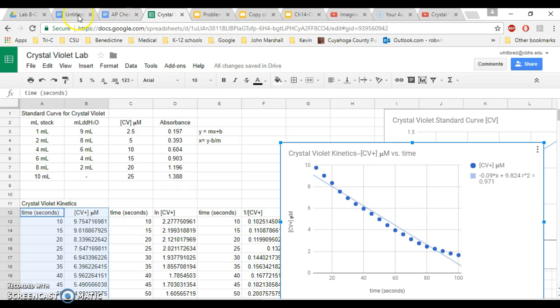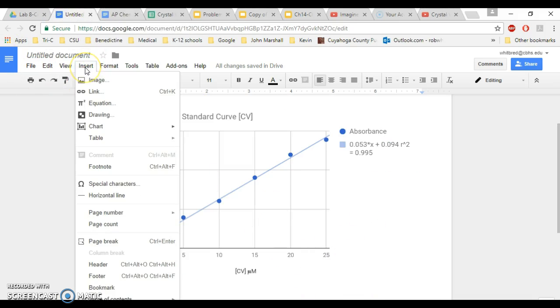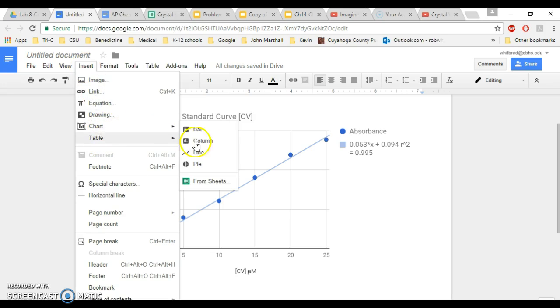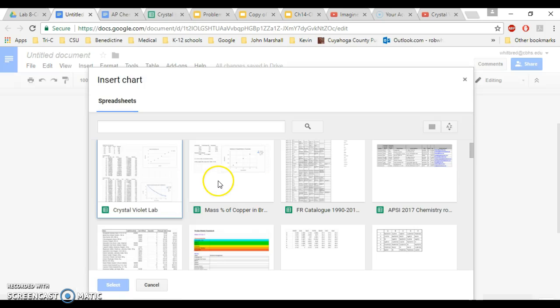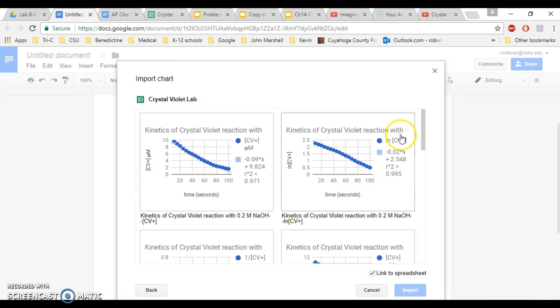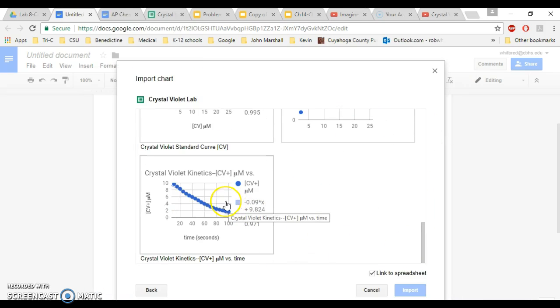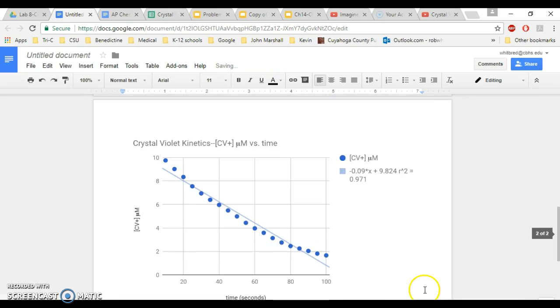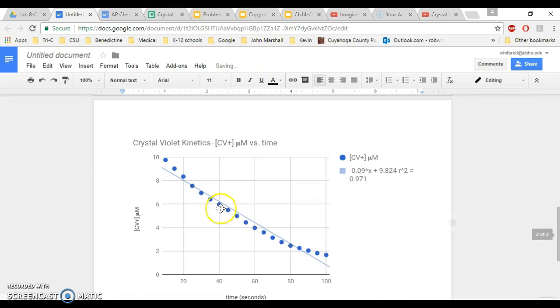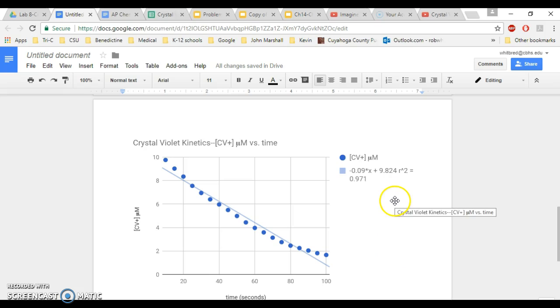So again, I'm going to remind you that if you go under your untitled document which I currently have, I can then go under insert and I can select a chart from sheets, and I'm going to click on my crystal violet lab and I'm going to scroll all the way down until I get to the most recent one that I made and hit import. And you're going to do that for each one of these charts because all three of these charts in addition to the standard curve should be included in your lab report. And with that, we're going to stop.